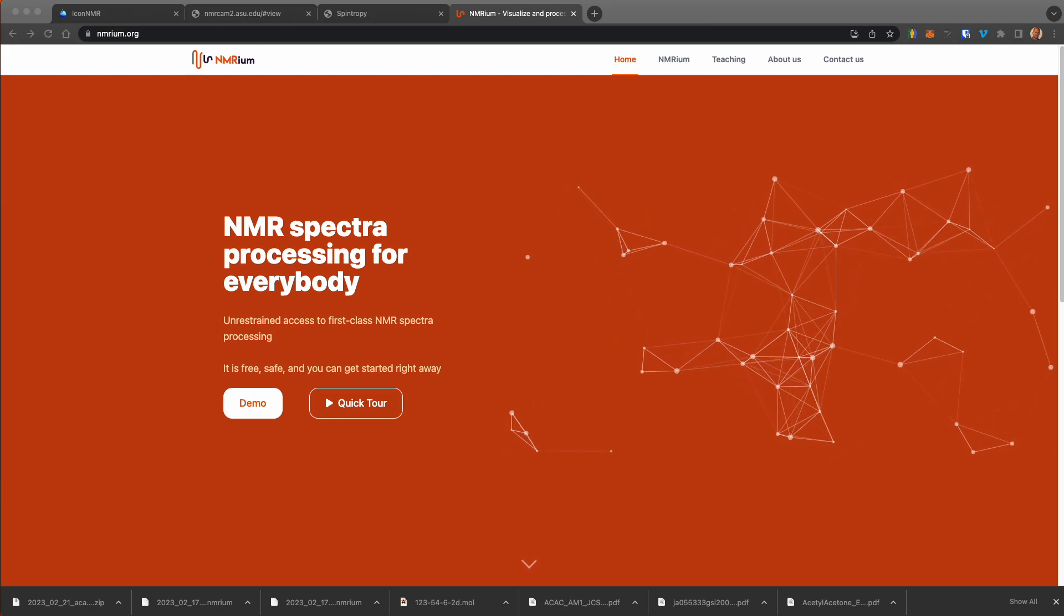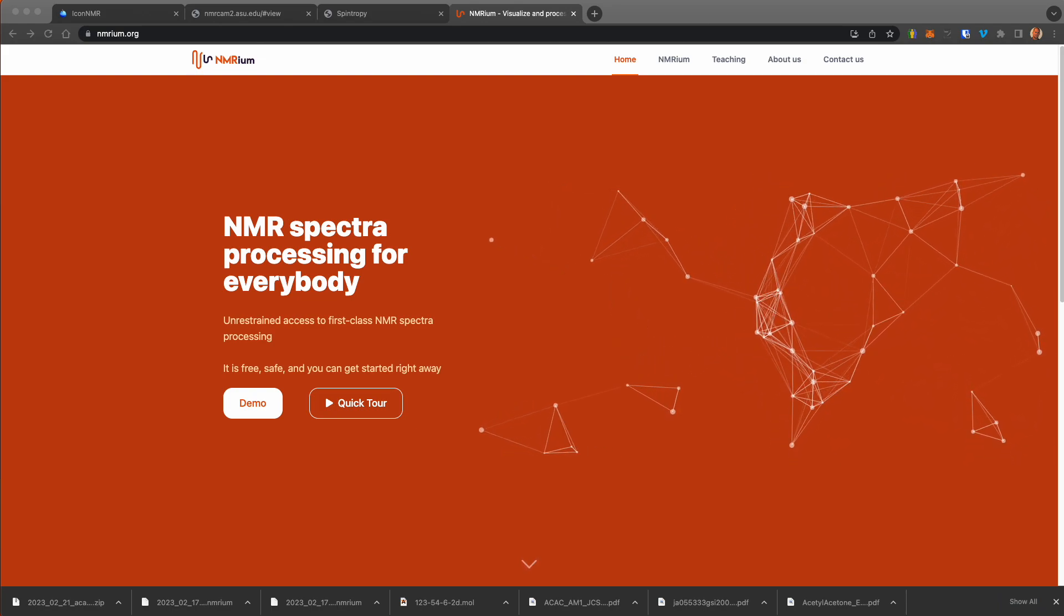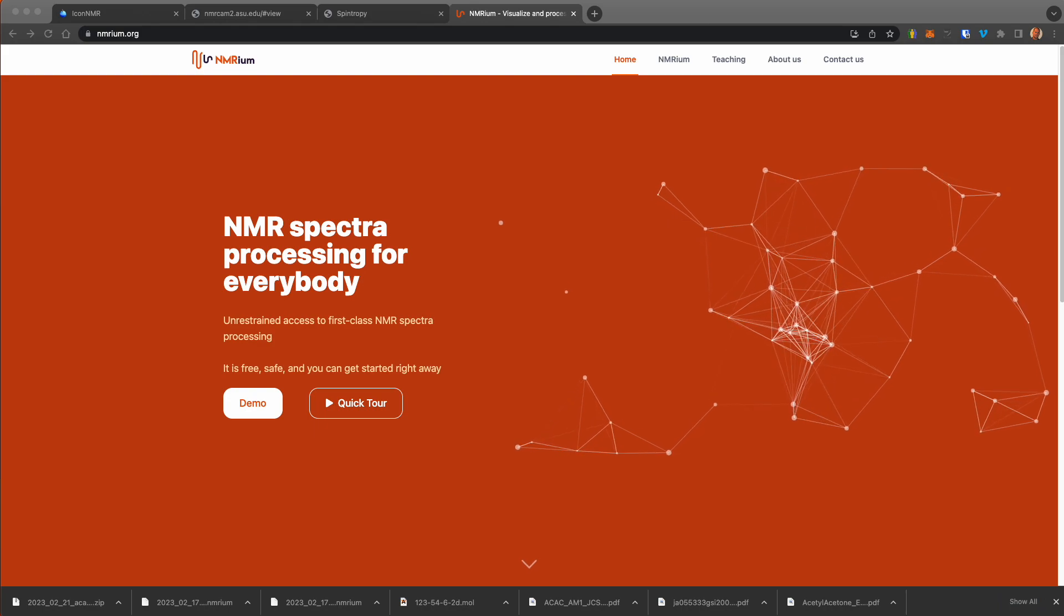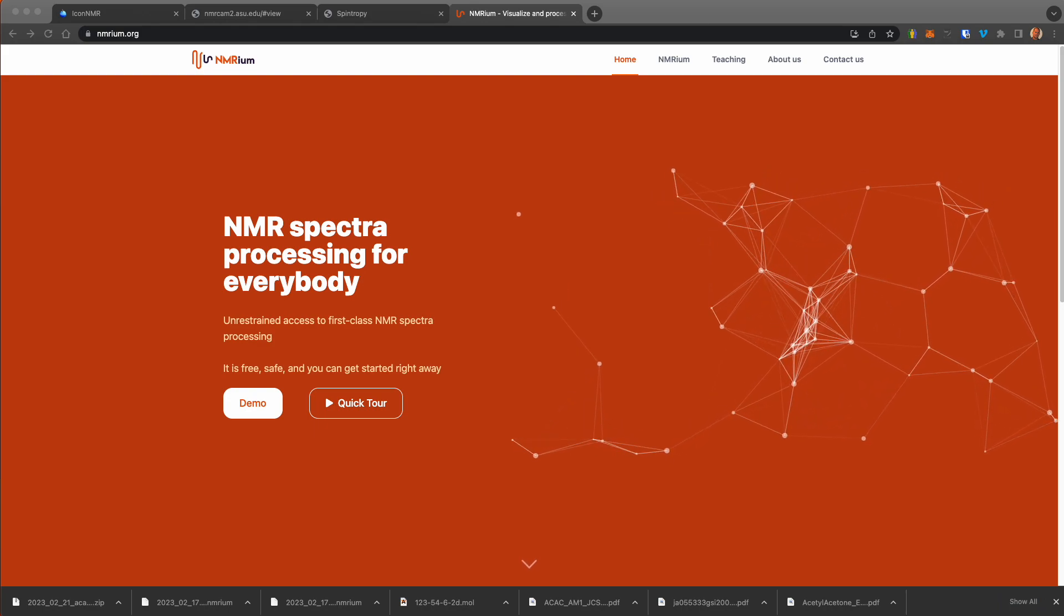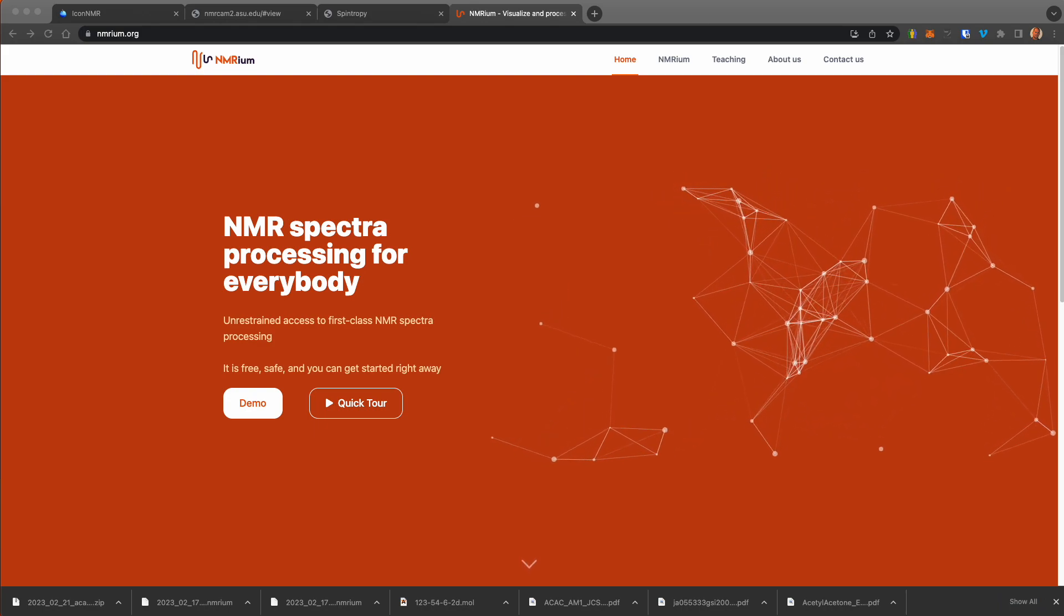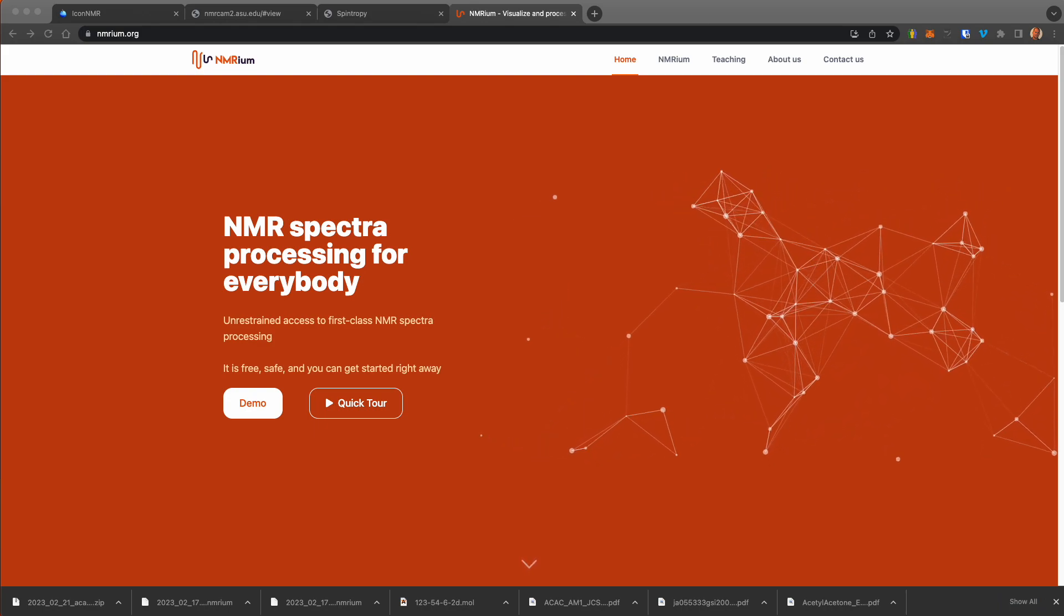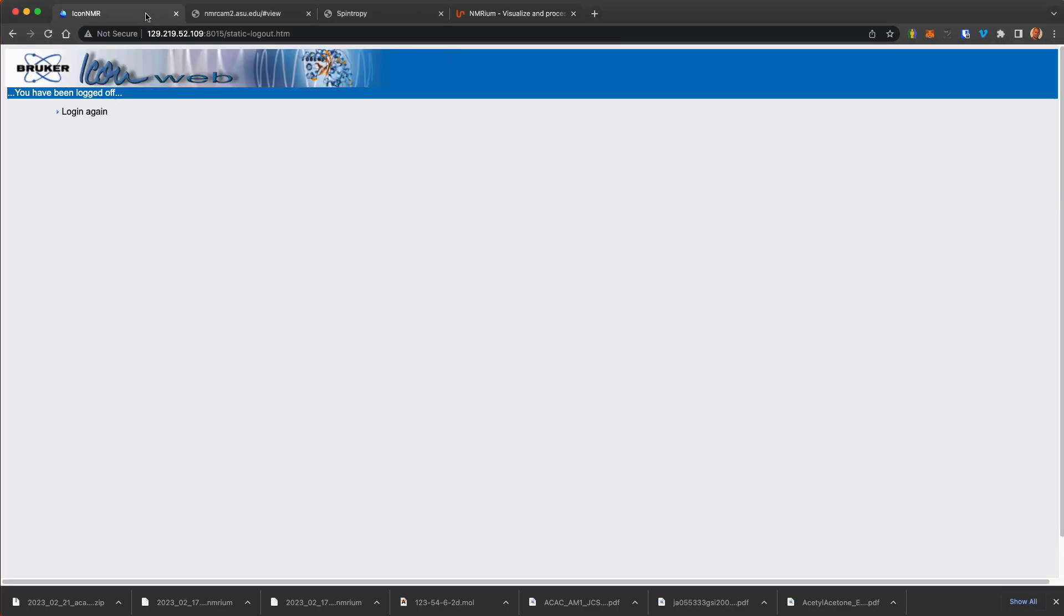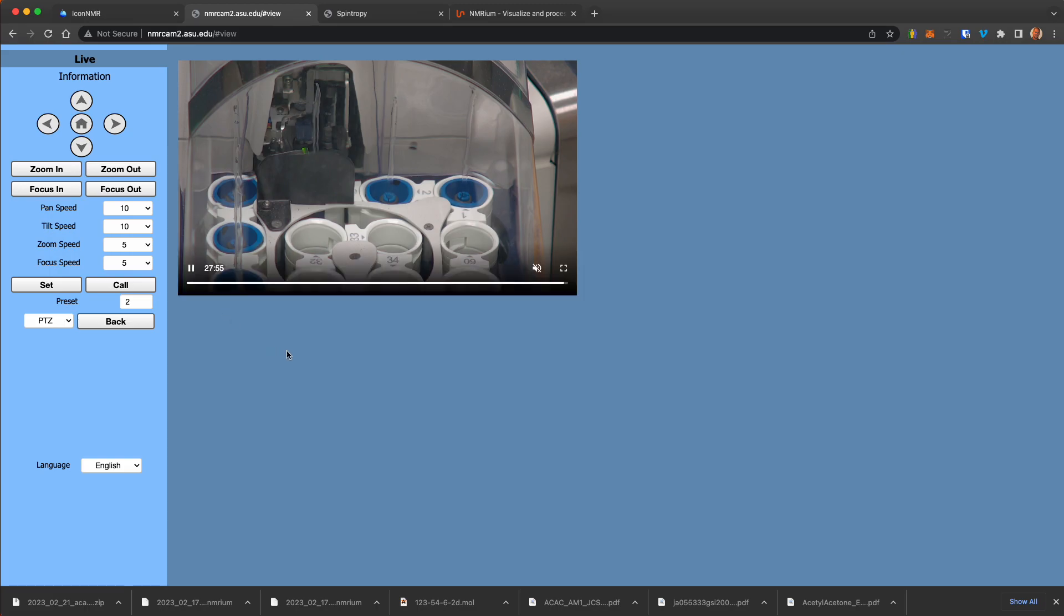So let's look at a quick example, and in this case we're going to look at acetyl acetone, which we've collected on a remote and automated Bruker 400 MHz NMR spectrometer at icon.web, where we set up and ran the experiment. We were able to view the experiment in real time.